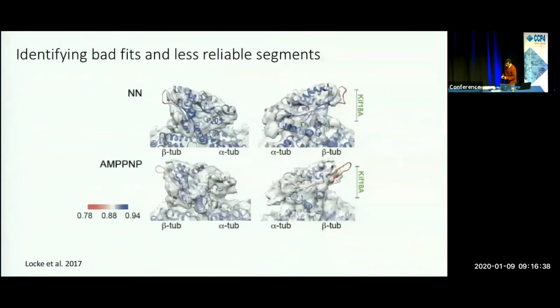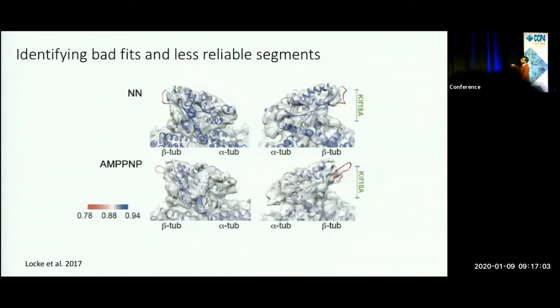You can use SMOCK to identify segments which are badly fitted. These can be either genuine errors or areas with less information. For example, some of the disordered loops are badly scored because there's no or less information available for evaluating fit in relation to the rest of the model.